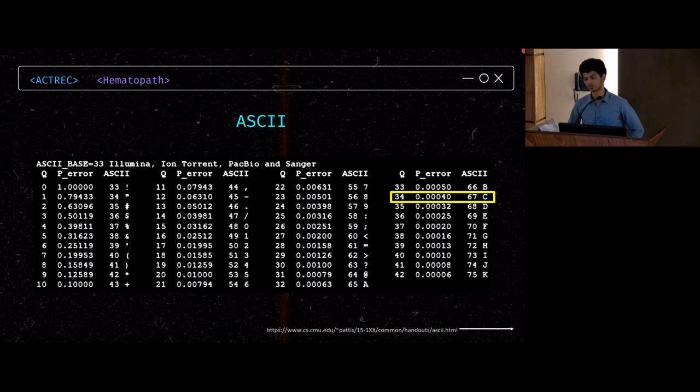It is generally not a problem. Single bases, even ONT is very reliable now, they say. But if you see Ion Torrent, indels is where it makes a call, is a problem. So you just have to look at a BAM file of an ONT or one of these. You will be appalled.